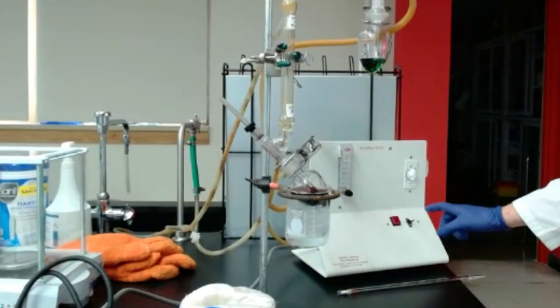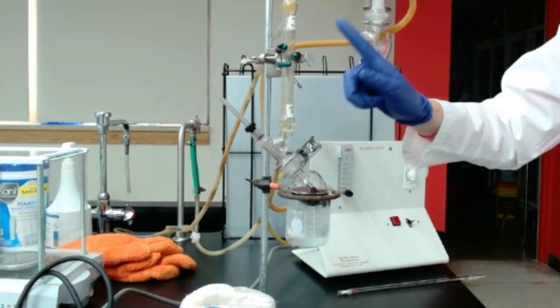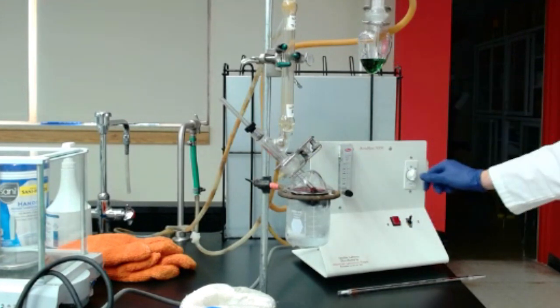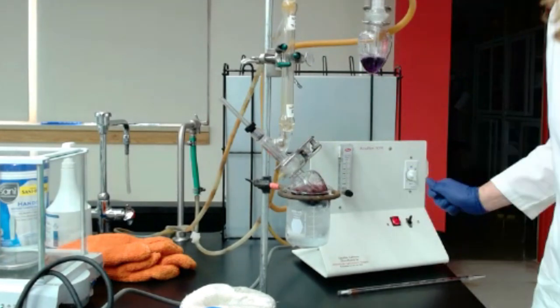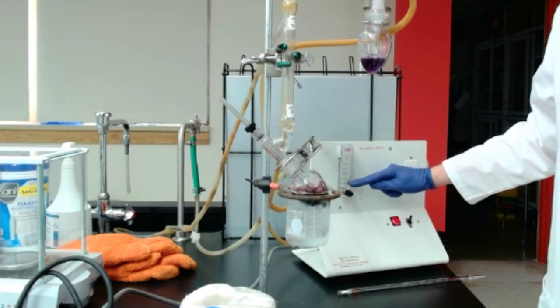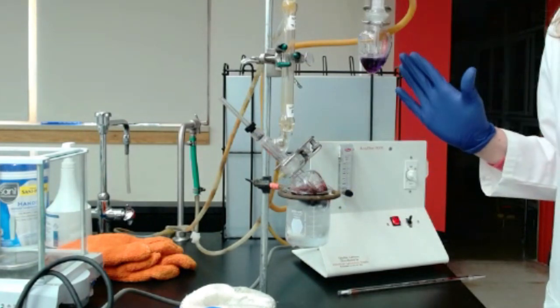Because now we're going to start the flow. The goal is to have air sucked here to make sure it's going to bubble. The air is going to go back to that solution of hydrogen peroxide. So I'm going to turn on and start a 15 minute timer. When I turn it on, I have to make sure the flow rate is correct. You have 1 liter per minute. That's the flow rate you should use. You can adjust with that wheel. And then you're just going to wait a little bit.